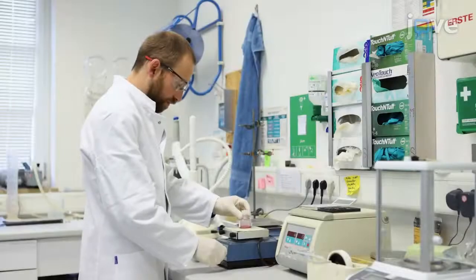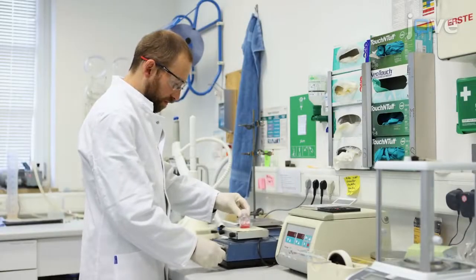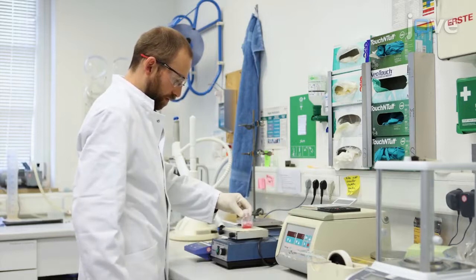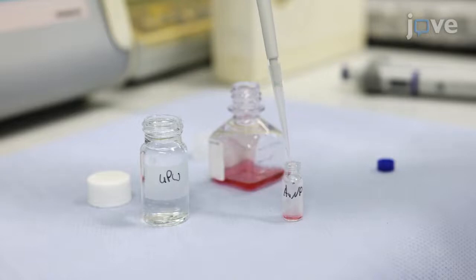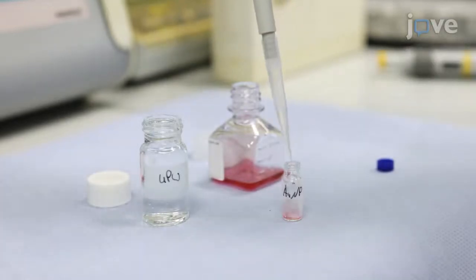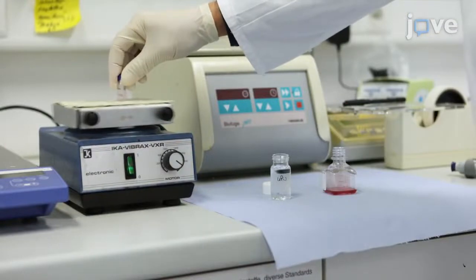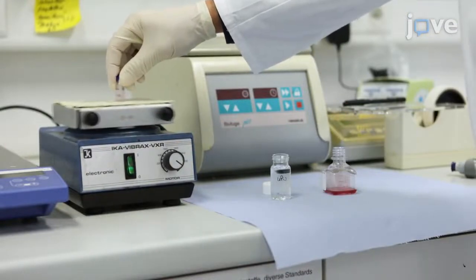Begin by vortexing 50 milligrams per liter of an arbitrary gold nanoparticle size standard for 2 minutes, before diluting the standard to a 1 to 4 ratio with ultrapure water. Then vortex the diluted solution for an additional 2 minutes to obtain a homogenized suspension.